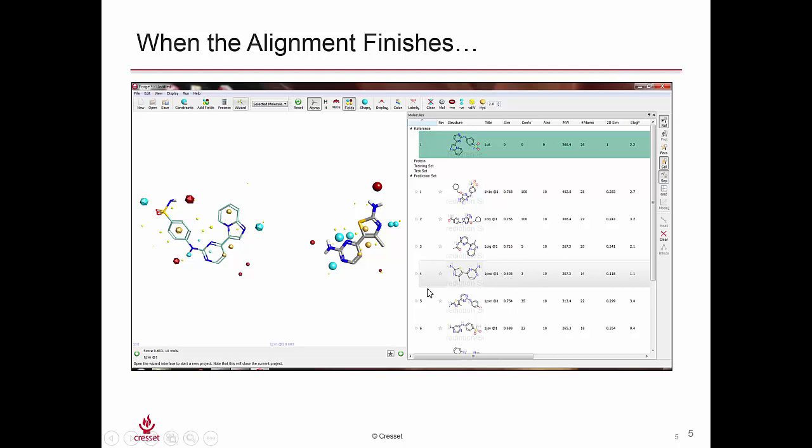The one that we'll be interested in is this 1PXO ligand, which has an alignment score of about 0.6. We see this in the window here, and this is a fragment. What we're going to do in this experiment is build coming off this amine group to develop a ligand that takes advantage of these field points exhibited by this portion of the reference structure.